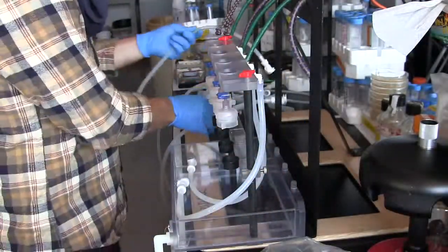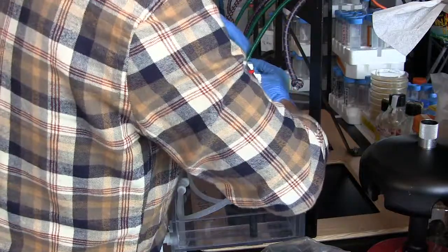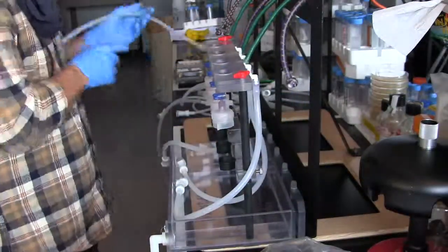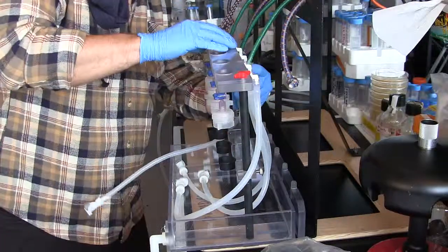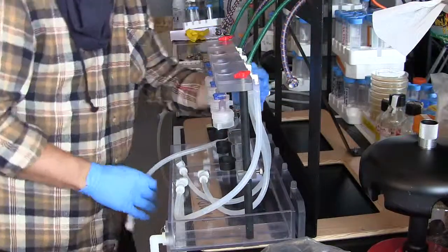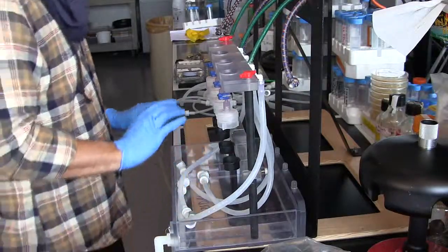Nice. And I like to keep them inside the little basin here. That way, they stay nice and contained, won't get into any trouble and get contaminated.